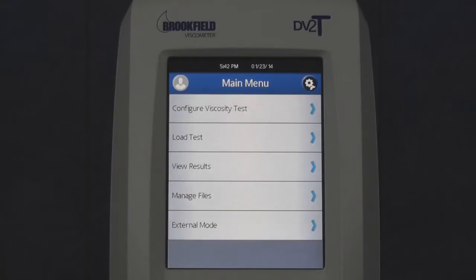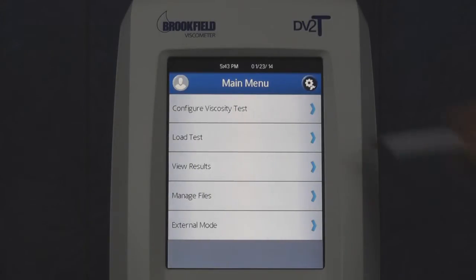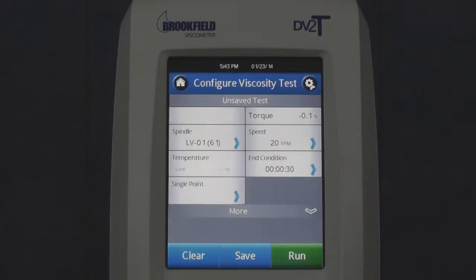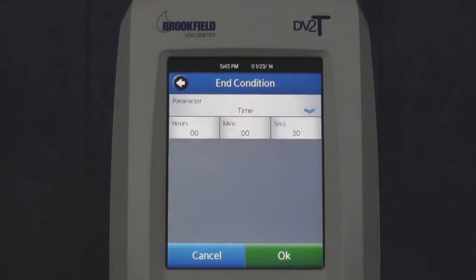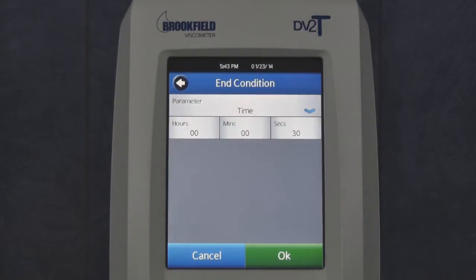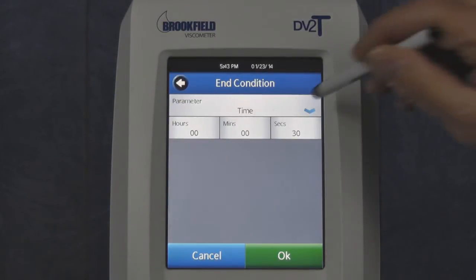End condition parameters define the completion of a test. Each time you enter the Configure Viscosity test screen, the end condition will be set to the last value used. The end condition can be changed by pressing the blue down arrow within the parameter field.